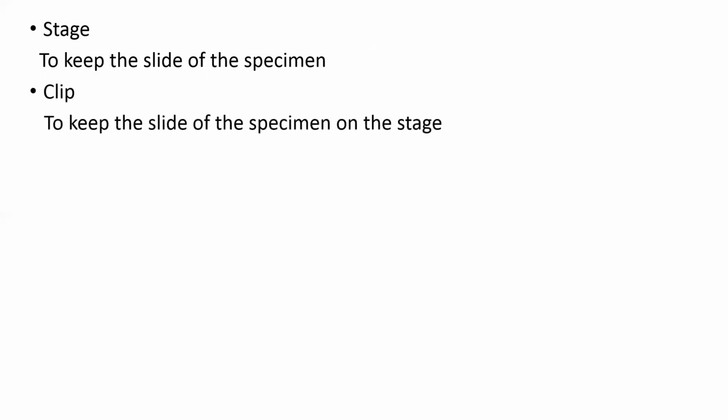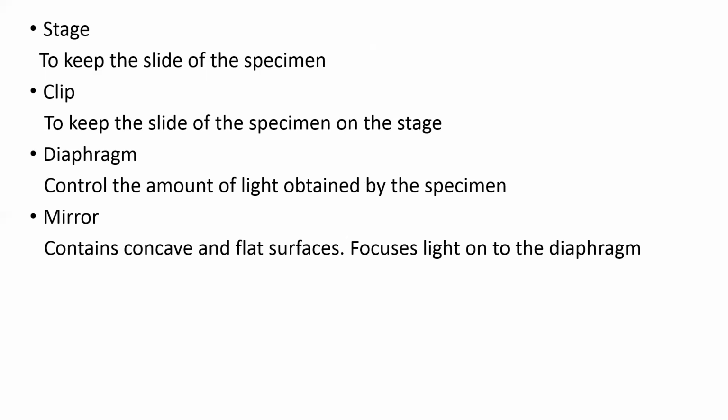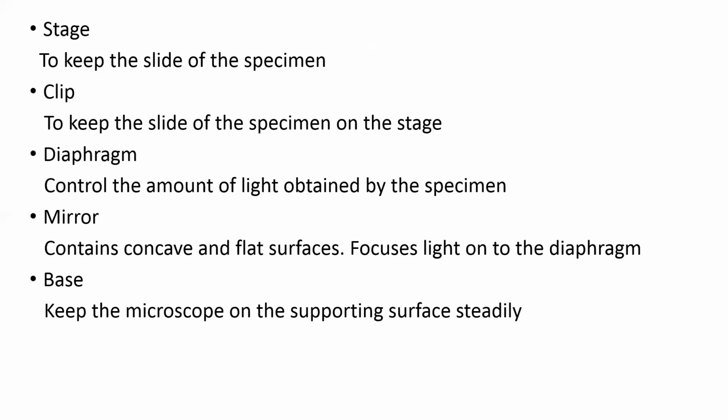Stage, to keep the slide of the specimen. Clip, to keep the slide of the specimen on the stage. Diaphragm, controls the amount of light obtained by the specimen. Mirror, contains concave and flat surfaces, focuses light onto the diaphragm. Base, keeps the microscope on the supporting surface steadily.